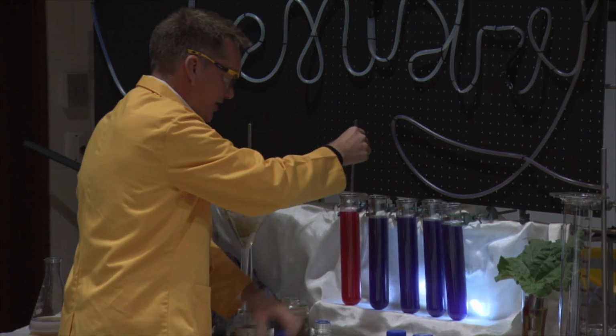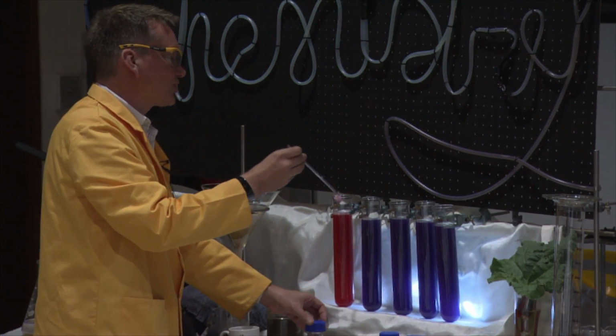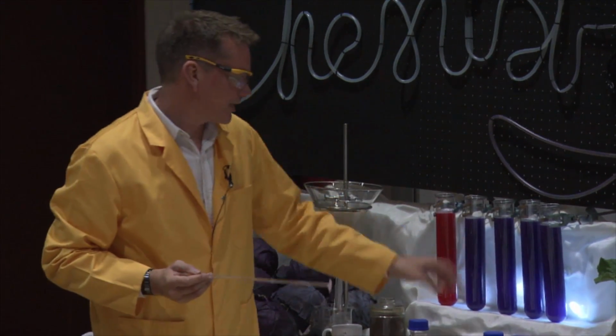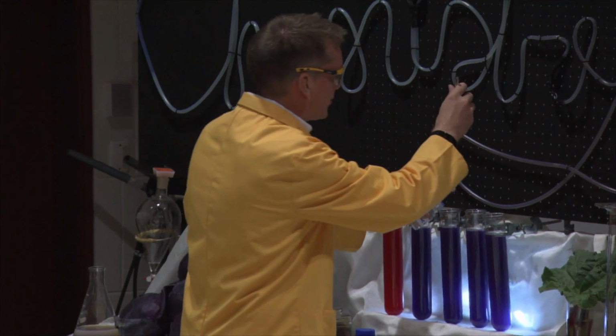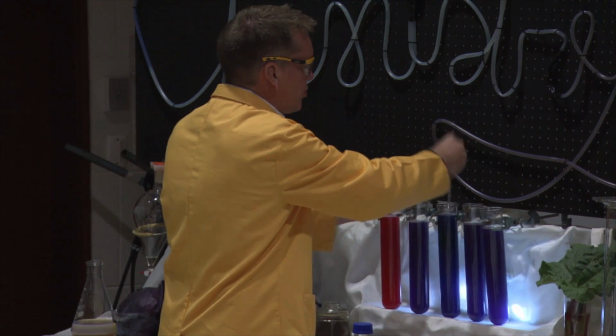and it goes instantly red. Okay, so this shows, it indicates the presence of the acid here. So we'd say that this compound acts as an indicator. Okay, we'll leave this one as it is. I'm going to add, well, this is some lime water or calcium hydroxide. I'm going to add a little bit of that to this one. And this should go as sort of a bluer colour.